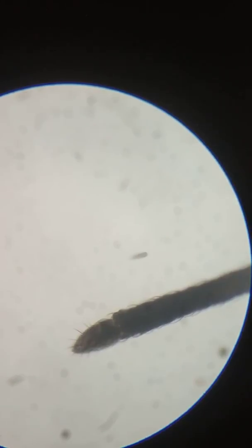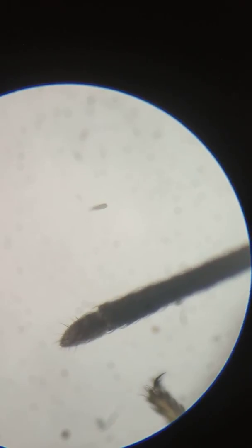The focus is not so clear because the animal is alive and it keeps on moving a lot. This is the tip of the proboscis — you can see it clearly. There you are. This is the tip which it inserts into our body in order to suck our blood.